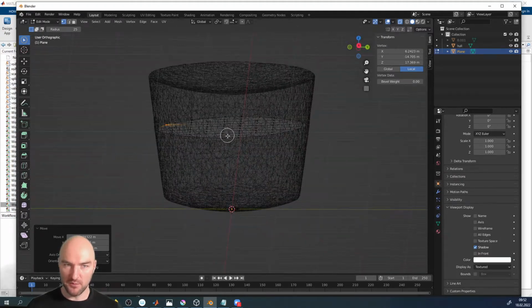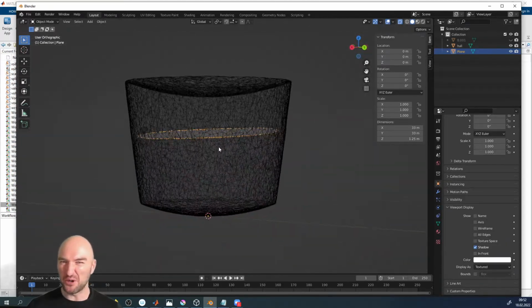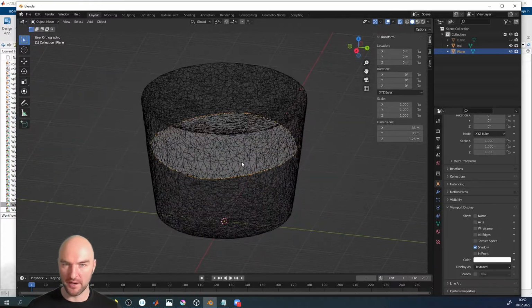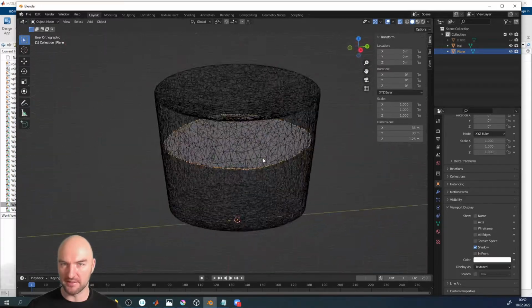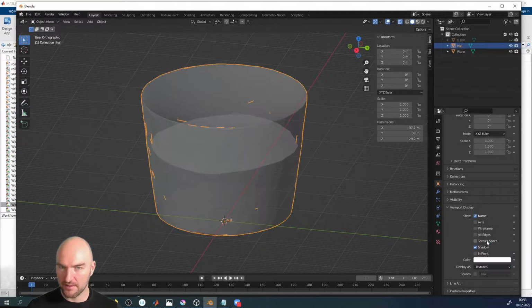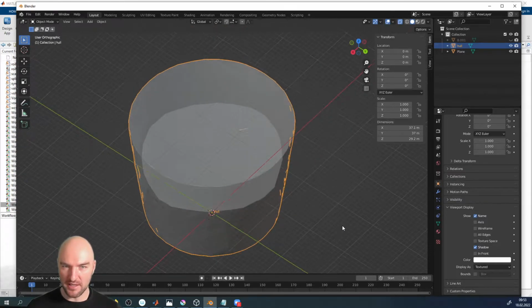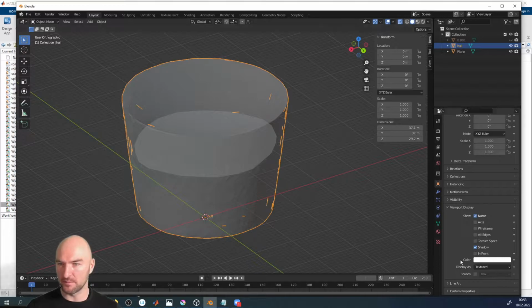So now you can see, if you just want to calculate an interfacial excess, that's probably not too bad an approximation of the area your grain boundary takes up in the data set. It's not perfect. If I click on the hull and make it appear in full, we can see that the vertices are not exactly on the boundary, so we're missing a little bit of area, but not that much. Maybe a little bit, but not much.